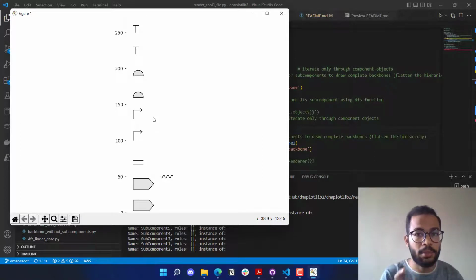There is no link between the same object when it is a component and a subcomponent at the same time. We can get its attributes using the component, but not the subcomponent. If we correct this, this will be automatically corrected to 2 backbones and a molecule, and also will be sorted.